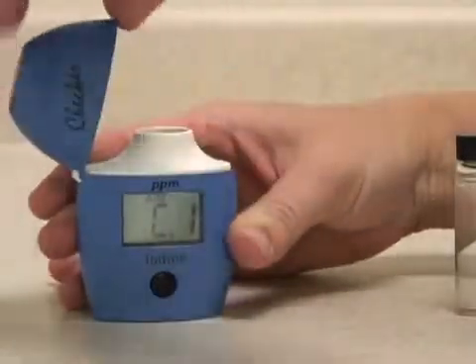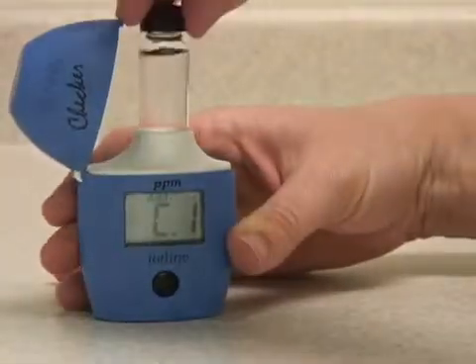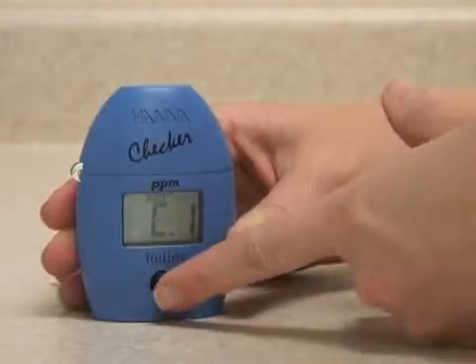open the cap and insert your blank sample to zero the instrument. Close the cap and press the button again.